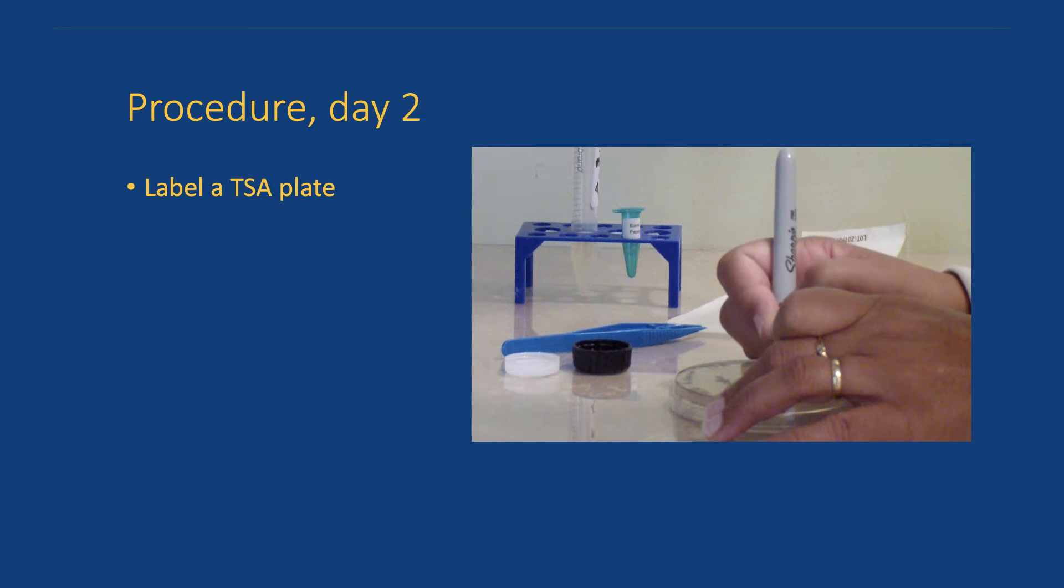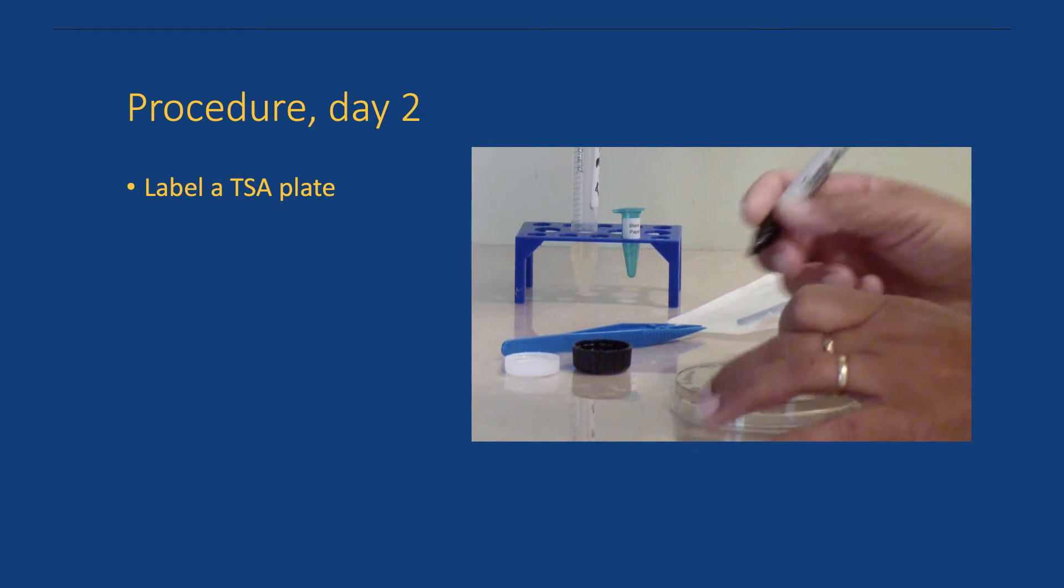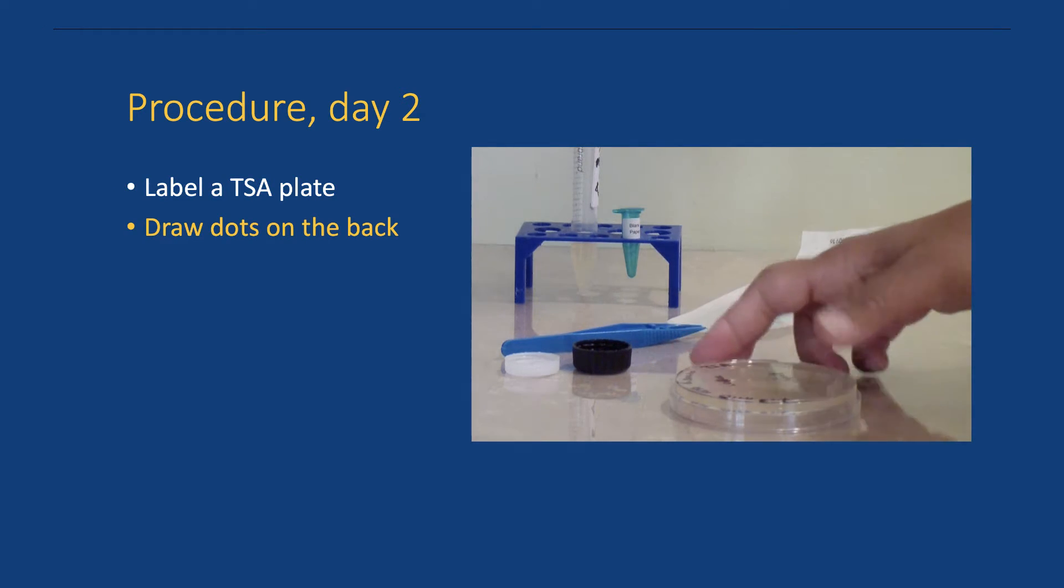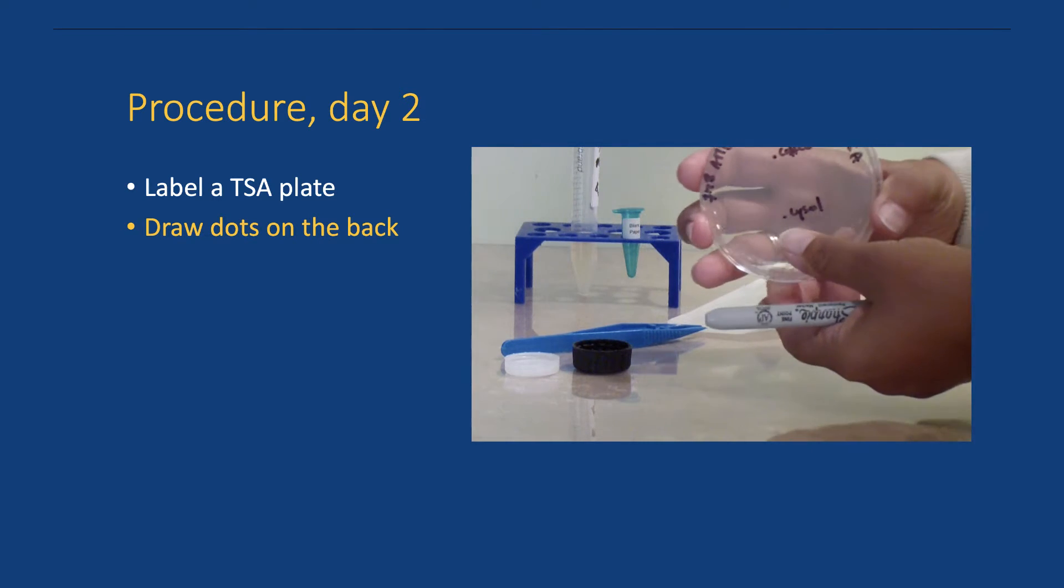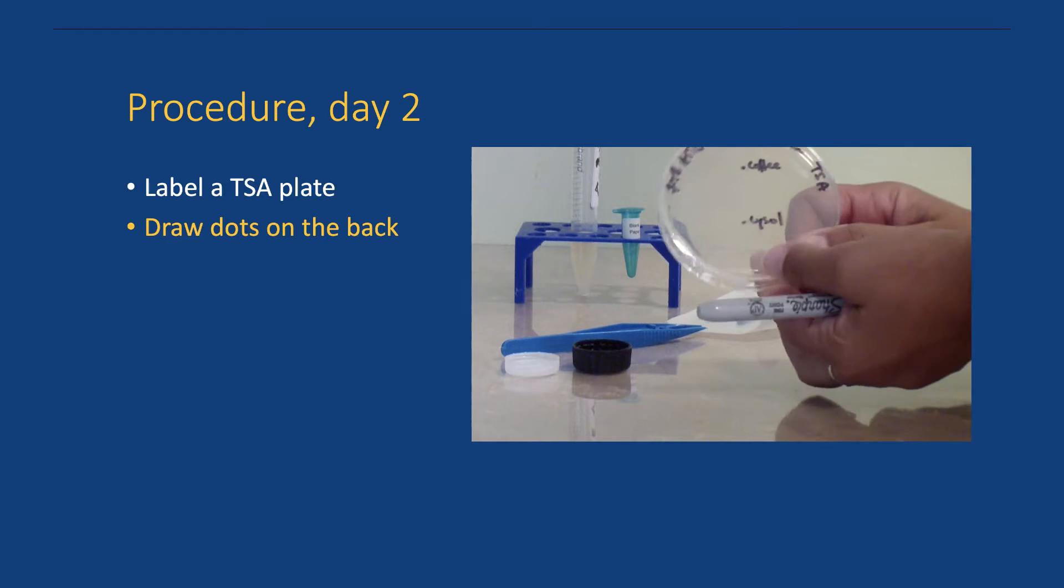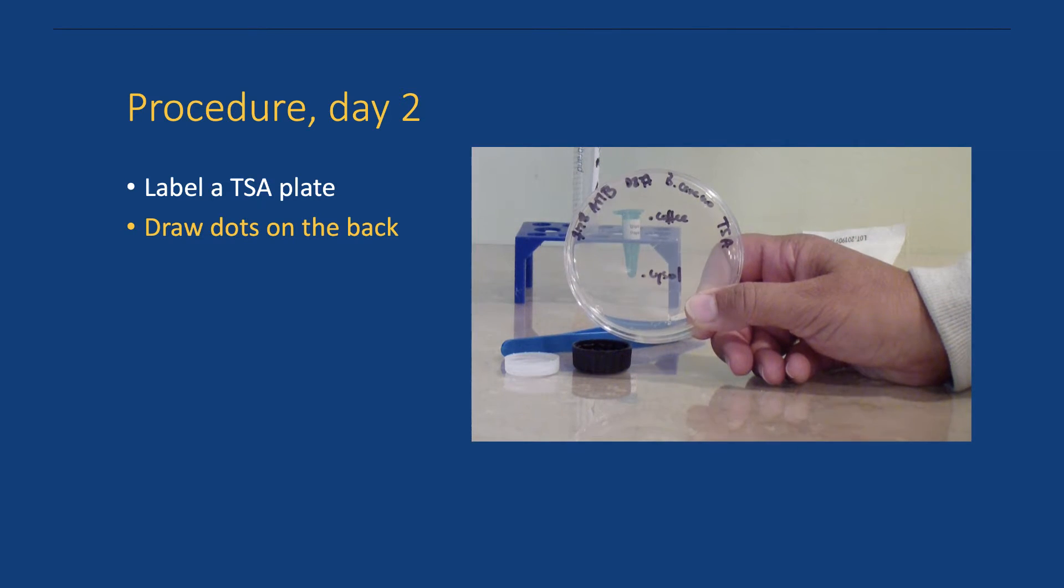On the second day label a TSA plate with the required information. Draw dots on the back of the plate. This is where the discs will go. Use at least two discs, but you may use all the discs if you want. Spread the dots out evenly over the back of the plate.